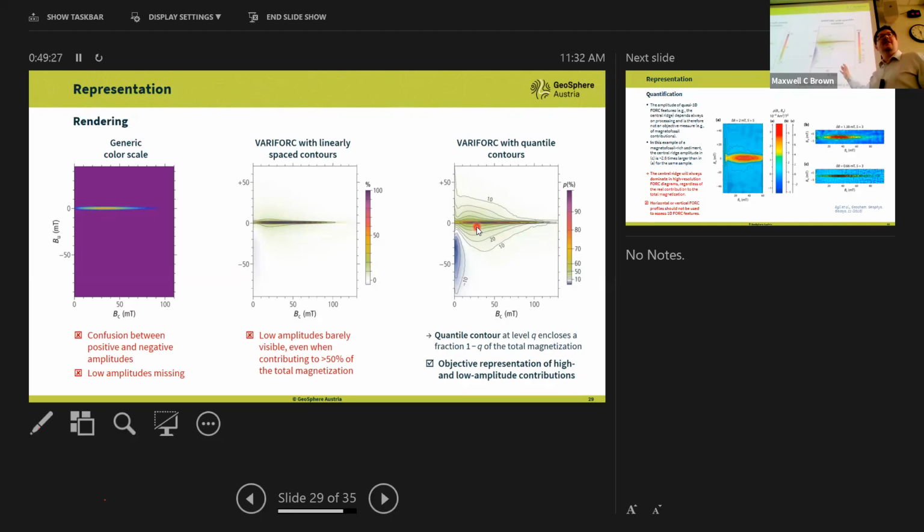So I stress this. There are a lot of papers speaking about lake sediments or marine sediments where you have this central ridge feature, and there is almost never a quantification of how much of these particles that produce the central ridge are inside, with respect, for instance, to lithogenic particles. And using this kind of plot can help.